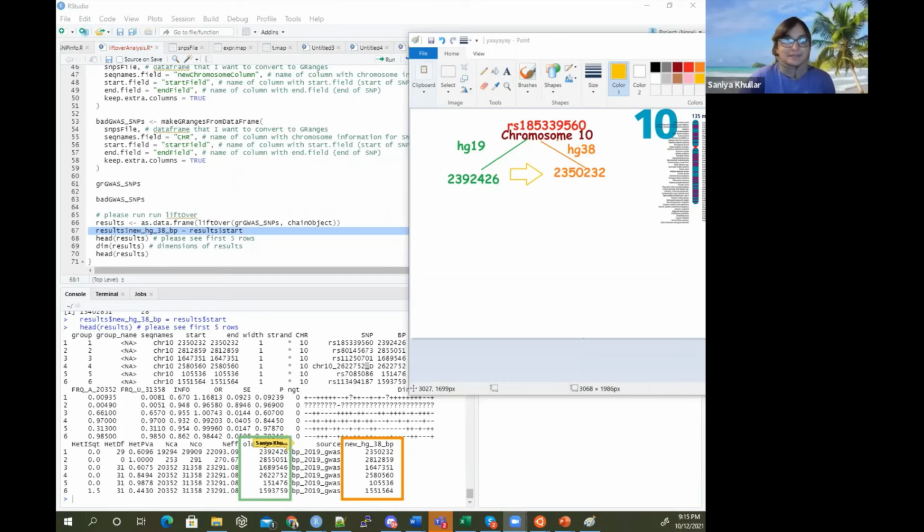So that is just the best thing that we did. We did that conversion.